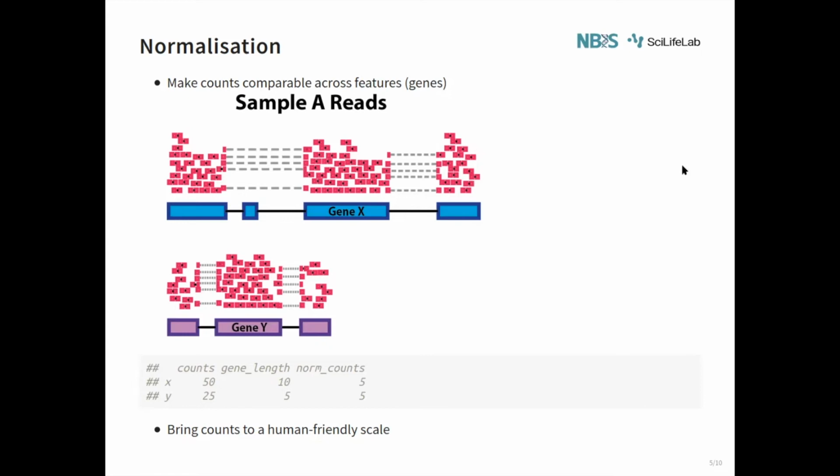This is why, if you read about this, there's a thing called gene length, but there's also effective length. I think this is what they talk about, effective length, when you look at the papers. Yeah, thanks. Mm-hmm.